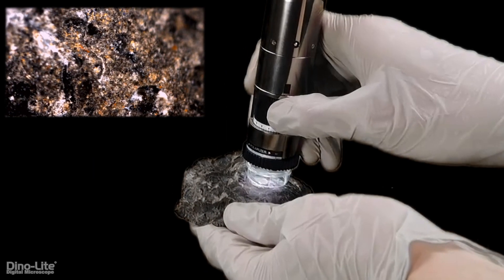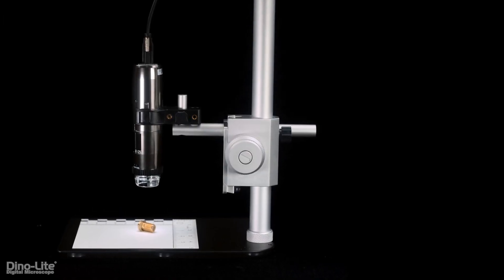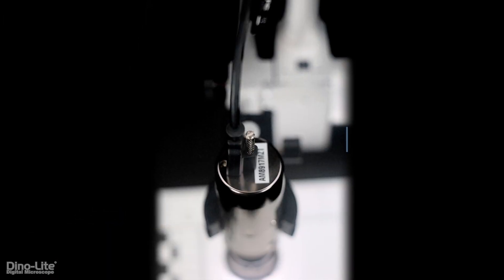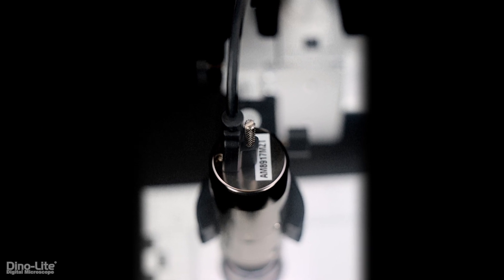Dynolite Digital Microscopes can be used handheld or with one of our several stands. New to this series, each scope is also outfitted with a threaded USB-C cable lock.